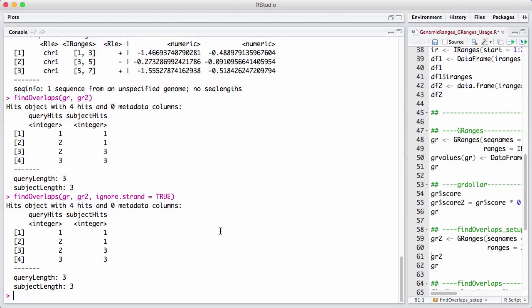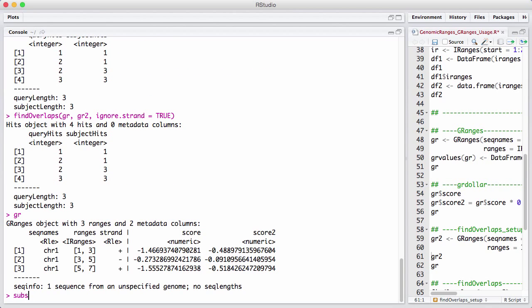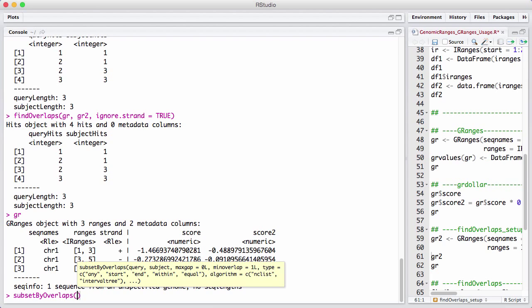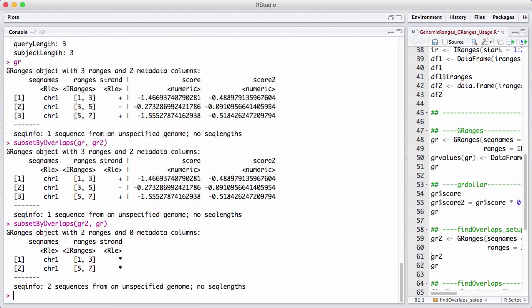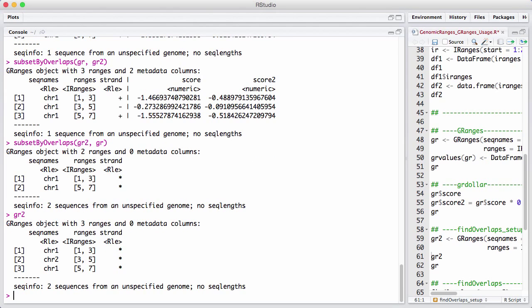A very common use case is when we have a GRanges and want to select only ranges that overlap some other elements. For that, we have a convenience function called subsetByOverlaps, which is basically constructed using findOverlaps. Let's take our original GRanges and do subsetByOverlaps of GR and GR2 — everything overlaps, so that was not too exciting. Let's turn them around: when we ask for the ranges in GR2, we don't get any overlap with the range on chromosome 2, so we return an object with only two ranges. This is a very convenient function — I use this a lot.